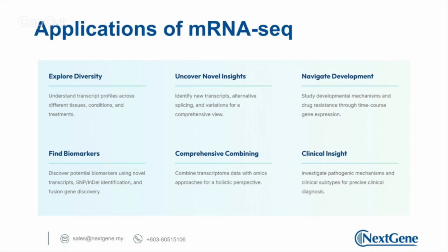most of the time we already know what genes are available and what transcripts will be produced, but sometimes we might still be able to detect novel transcripts, some isoforms that we have not identified before. Maybe it's only present in certain conditions or under certain stress, then we might be able to identify new transcripts due to alternative splicing. And in some less studied organisms, we might even identify novel genes, that is, genes that have not been discovered before.